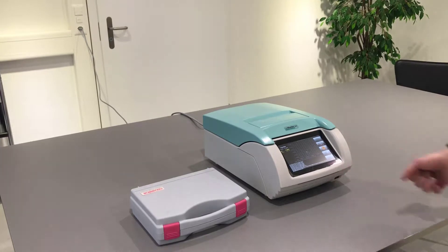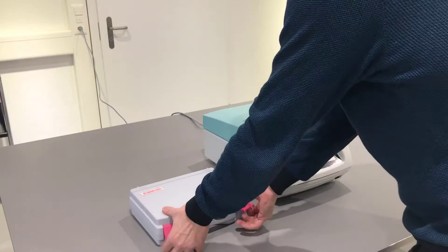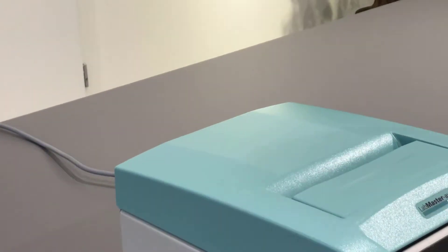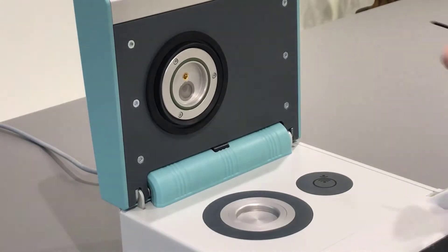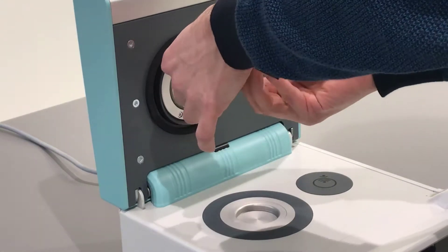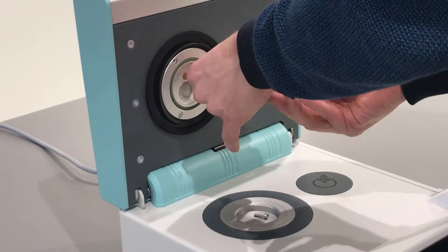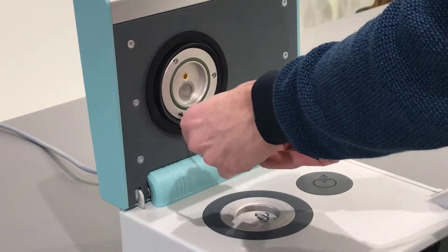Switch off the instrument and let it shut down completely. Open the SALT standard case and take out the L&K. Open the instrument by lifting the bar. Use the L&K to loosen the three screws which fix the measurement head to the upper part of the LabMaster AW Neo.